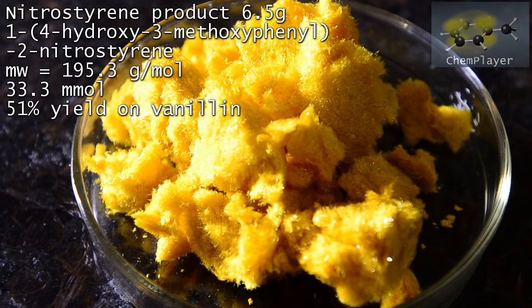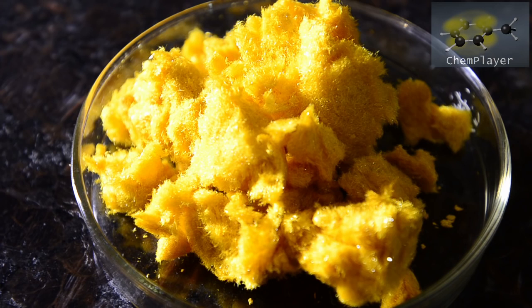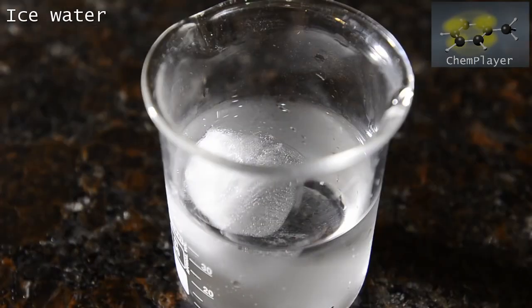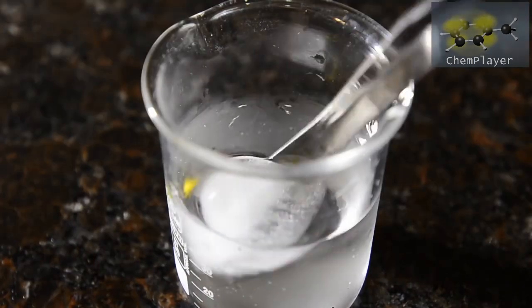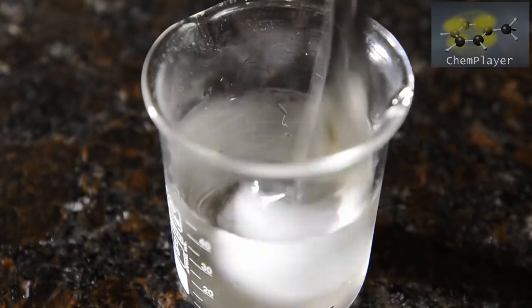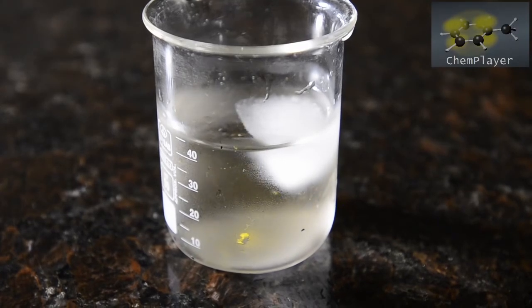During the workup and both filtrations, we noticed a large amount of red filtrate, and generally everything turned red. We wanted to know if this was a reaction byproduct, or something else. Here's some ice water, and a small amount of the yellow crystalline product. There's no color change, and the yellow crystals are insoluble, just floating around in the mixture.